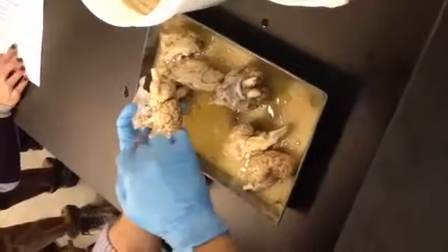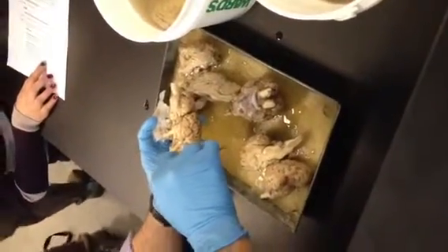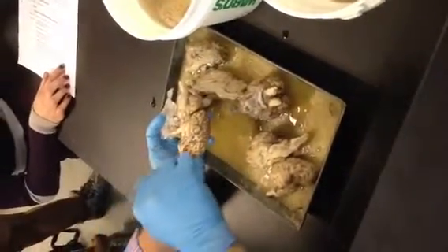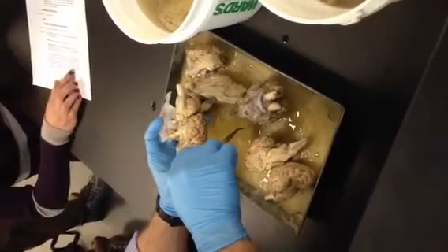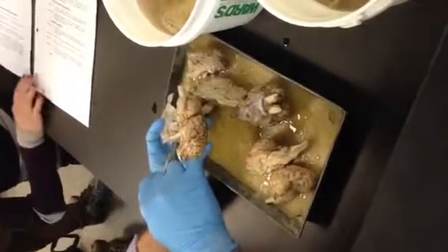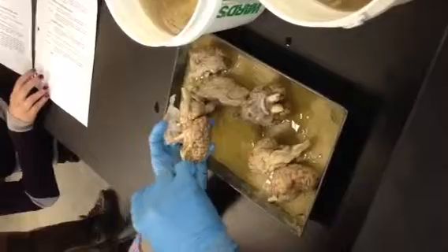Trigeminal nerve. Don't worry about trigeminal nerve on this. Know it from over there. Abducens nerve. Good. So we're going to skip over abducens nerve. I want you to note over there. Same with facial nerve. Same with vestibulocochlear, accessory nerve, hypoglossal nerve. So you won't have to know any of those off of the sheep brain except for 1 and 2. Olfactory and optic. Okay?